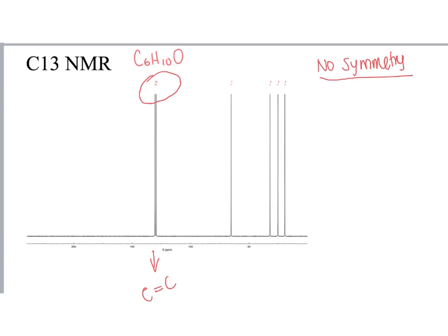carbon and carbon. The following peak close to this double bond is between 50 and around 70 to 75, which symbolizes the presence of an alcohol attached to a carbon. And then these last 3 peaks are the other carbon environments. So if we draw our molecule with a double bond here, an OH here.